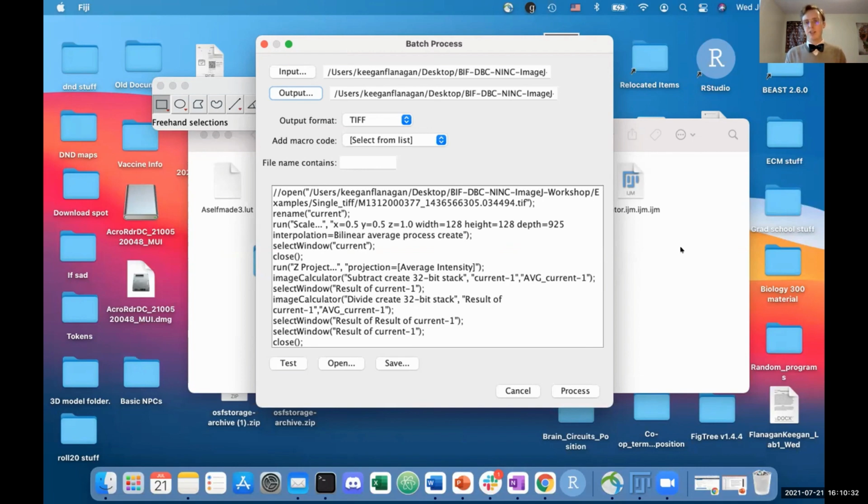And that last one, the result after you had completed the image division, is the only one that would be kept, and that's the image you would have applied the brightness and contrast to. So at some point, you must have either missed one of the calculation steps or perhaps closed something too early. And that's why when you closed the 3 files, you weren't left with any other images up.